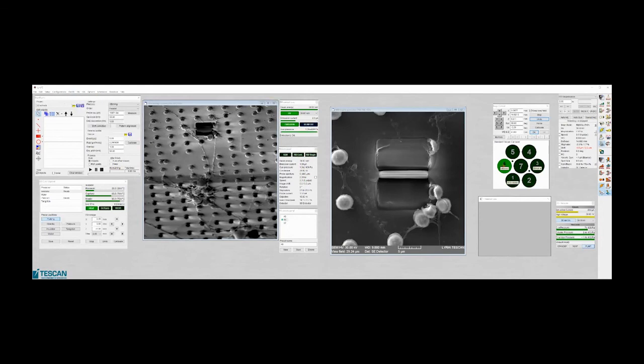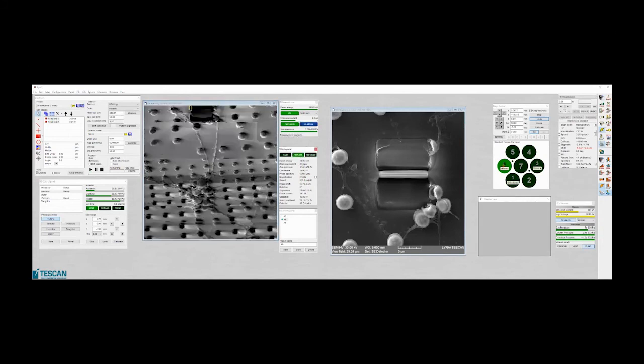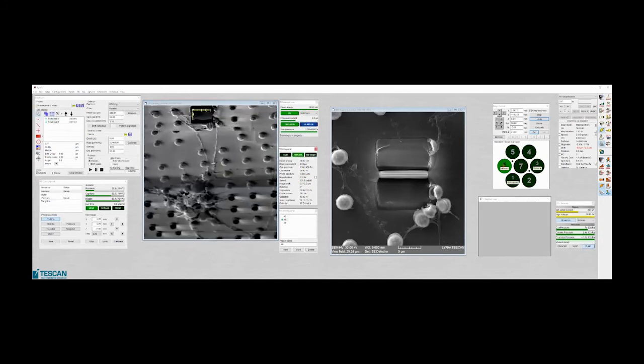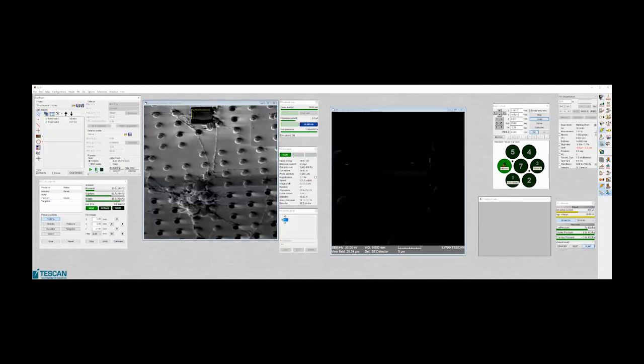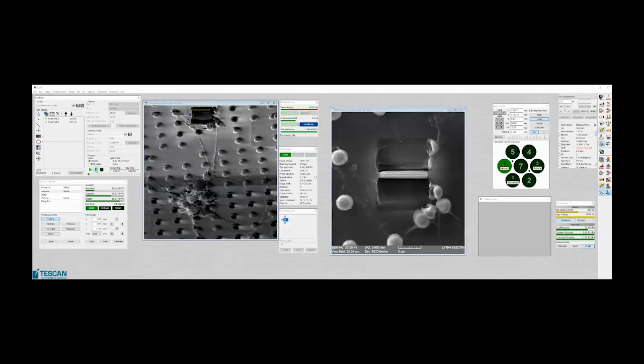So now we will cut it from the side and undercut it from the bottom. So now it's the analogy with this cake. You need to undercut it to see what you have from the bottom part. So I will let it run.